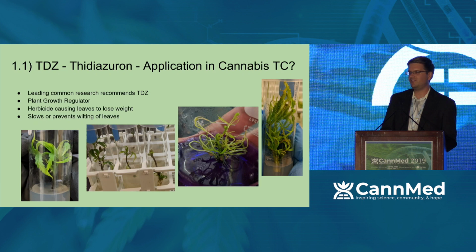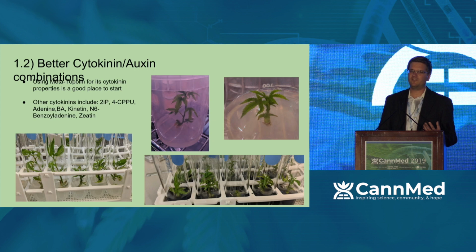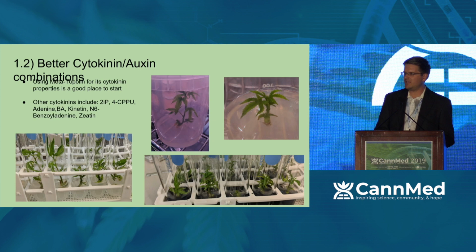So using better auxin-cytokinin combinations is a much better idea. Meta-topolin is the one I would recommend people start with. If you use meta-topolin, you get pretty good growth, but it doesn't always root, or it can have other issues. It's just a good starting point. I also included a lot of other cytokinins in this slide, so if anybody wants to experiment, try some of those out, your chance of success will go up. You also need to know that auxins in coordination or in ratio with those cytokinins make a huge difference.